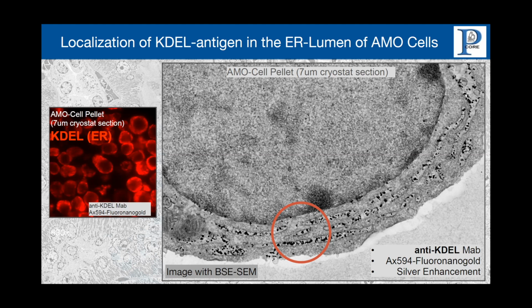You can take a standard carbon coater, and I think the setting is about 20 nanometers thickness for the carbon. Essentially what you want is a light brown metallic layer of carbon. If it's too heavy a layer of carbon, it may sometimes come off. Our standard glass slides are always Superfrost glass slides, carbon coated until it's a metallic light brown level.